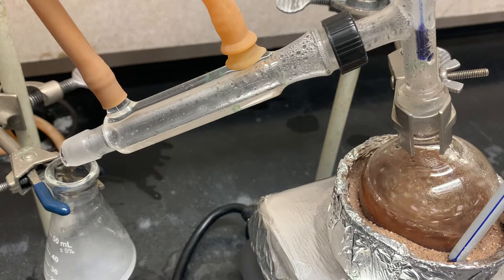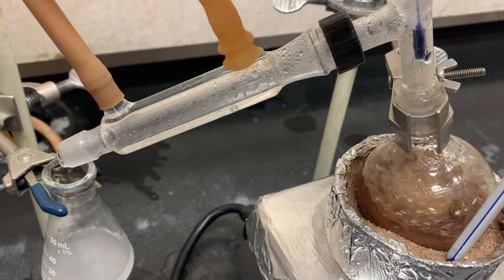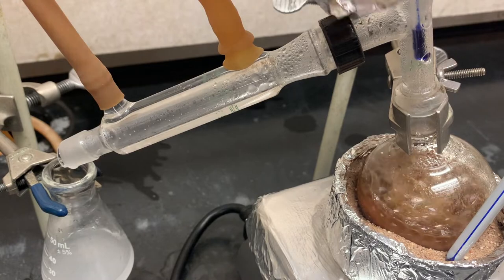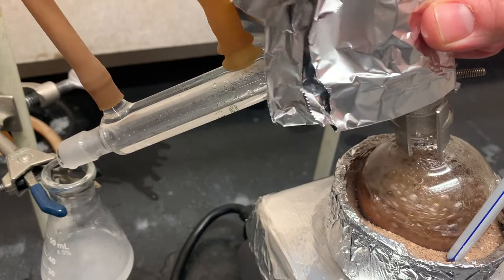Now if this is going too slow for you, you can take a few layers of aluminum foil and then wrap it around the three neck so to conserve some of that heat in the system. You can also wrap the round bottom, but because I want you to see what's actually going on there, I'm going to leave it uncovered.